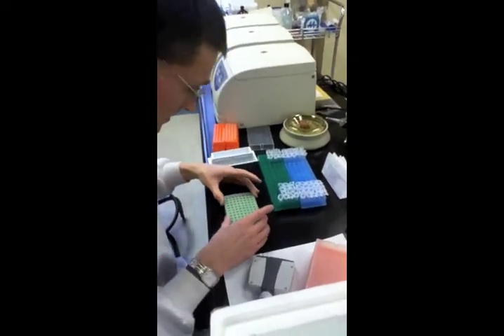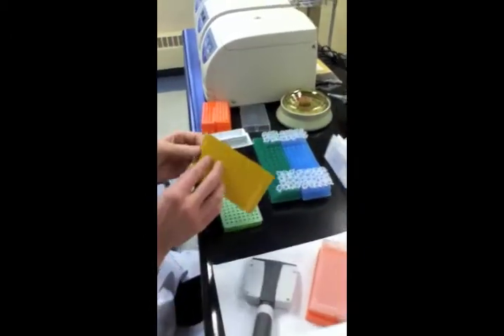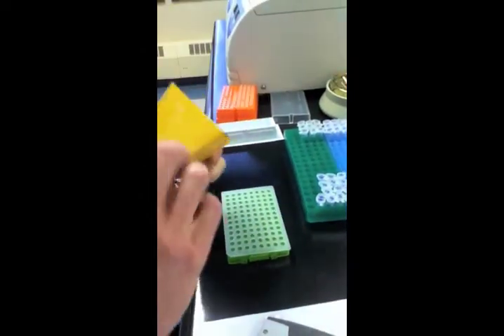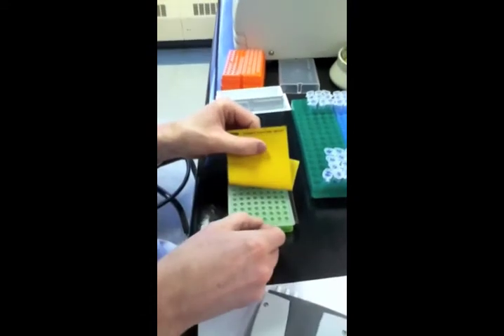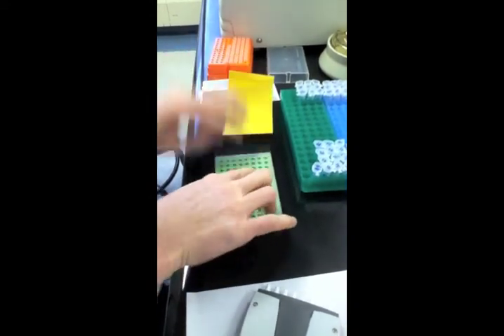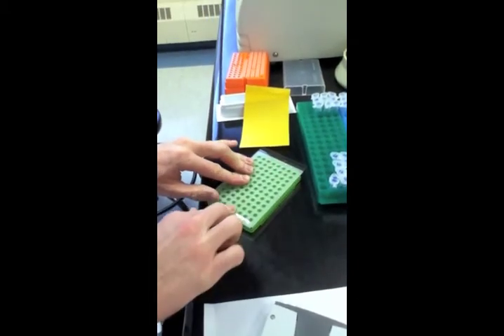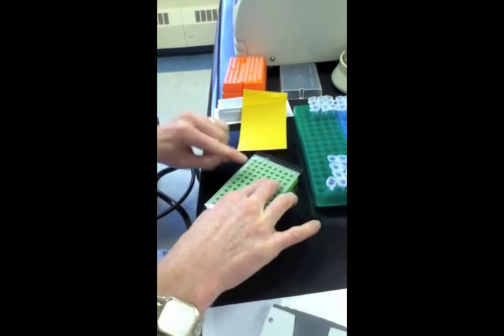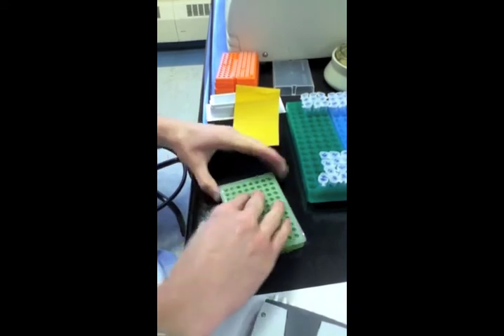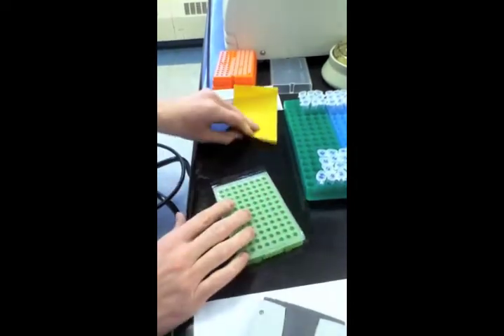And I will add the magic tape, magic sealer. I have to remember how to do this. I haven't done one of these for a while. Now, there we go. So it's adhesive on one side. I have to square it up to make sure there's enough to go all the way across. There we go. We made it. And use the high-tech sealant device, a finger. And I'm trying to make sure I've got a good seal with every tube.